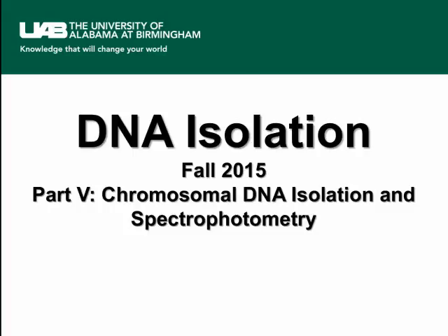And so the next and the final part of this DNA isolation will be part number 5. And when we come back, we're going to talk about how you purify chromosomal DNA. We've talked about how to purify plasmid DNA, but in this section, we're going to talk about how to purify chromosomal DNA.